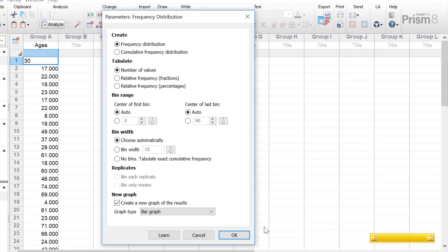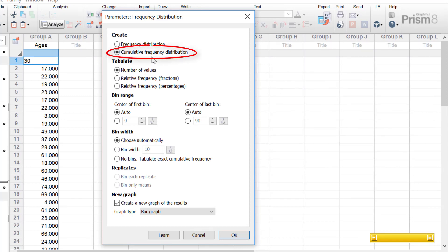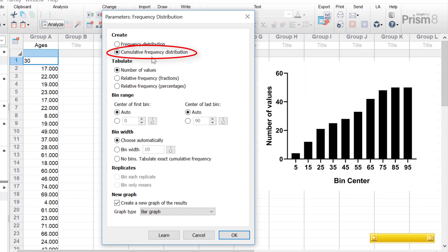The next window is the parameters window where you can tweak the options for the frequency distribution. Under the create sub-header there are two distributions that can be created. The first is a frequency distribution — a histogram where the values in each bin are separated, as seen on screen. A cumulative frequency distribution is a variation where the values in each bin are cumulatively added onto each other, so the end bin will contain the total number of values.